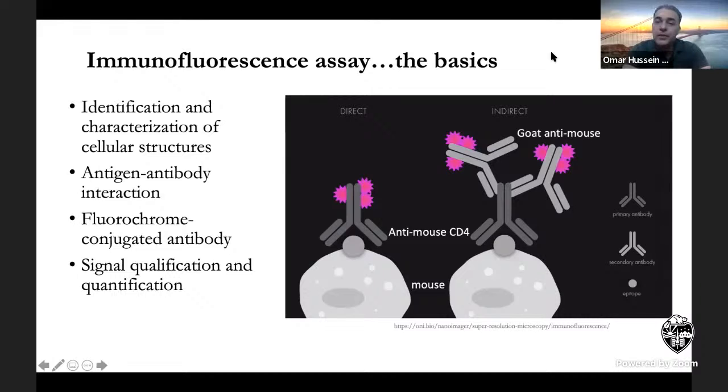I have another question, Dr. Adetunji. Have you done confocal with these infected cells? No, I didn't do it for this one, but the microscope that I used can do confocal. You were lucky to have that machine, right?